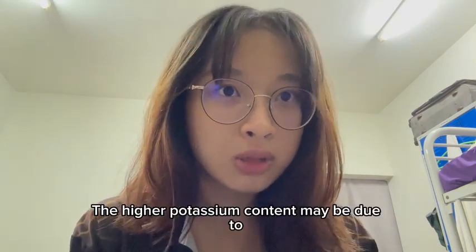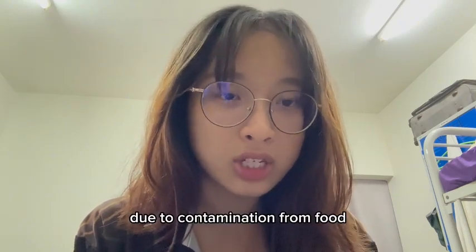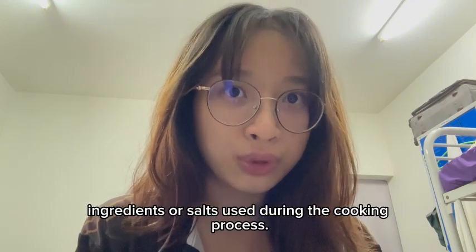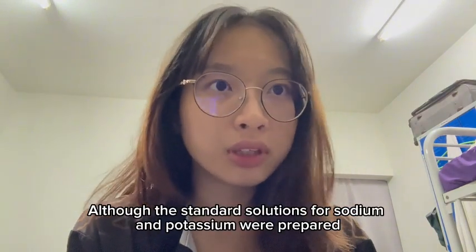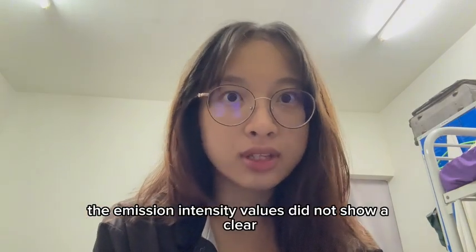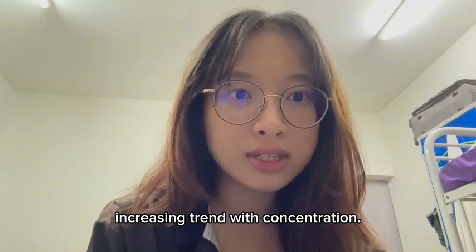The higher potassium content may be due to contamination from food ingredients or salts used during the cooking process. Although the standard solutions for sodium and potassium were prepared, the emission intensity values did not show a clear increasing trend with concentration.